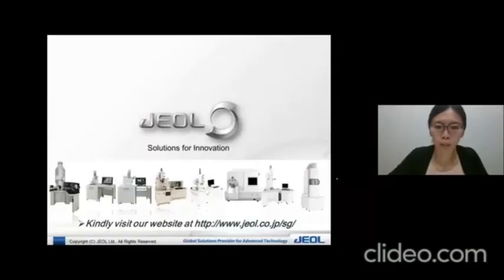Although SEM cannot achieve the same resolution as a TEM, with modern FEG-SEM technologies at nanometer-scale resolution, it is actually sufficient to answer many biological questions and applications. I come to the end of my presentation, and I thank you for your attention.